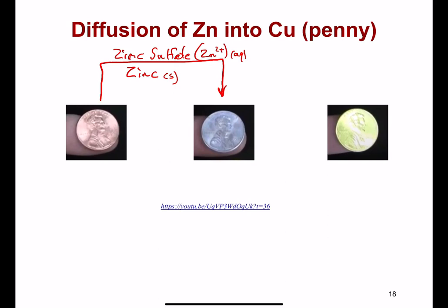The next part of the video, this gets transformed into brass, something like you might be familiar with, by the simple application of heat. Some additional things you might see: there's going to be a treatment of the zinc solid initially to remove the zinc oxide on it using an ethanoic acid to remove that oxide and expose that nice fresh zinc to make sure that this plating reaction occurs nicely. And then you'll see a rinsing to remove excess chemicals from the first step, and then a heating on a hot plate to give us that nice brassy look.